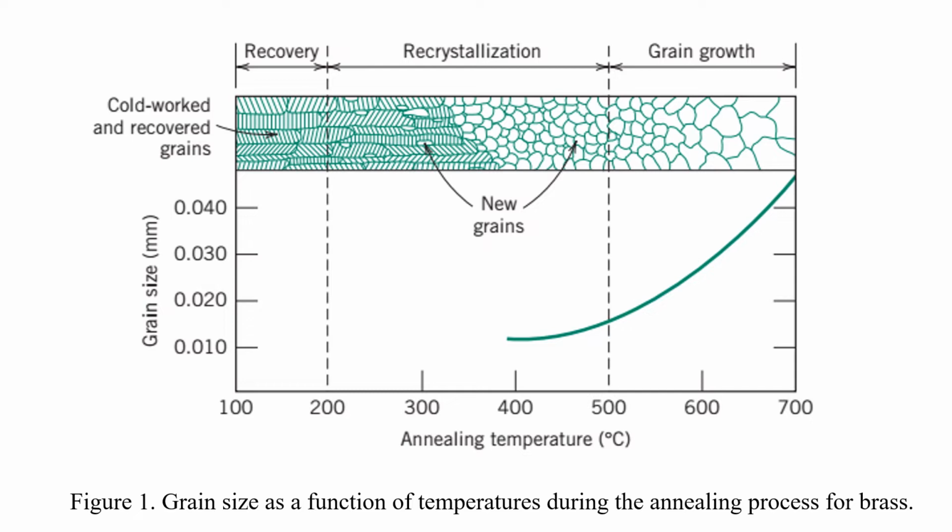Now, as the recrystallization is complete, increasing the temperature will let the strain-free grains continue to grow, and the small grains will gradually diminish, consumed by the large grains. As the grains all grow in size, the total area of grain boundary decreases, which will result in the reduction of mechanical strength of the material.